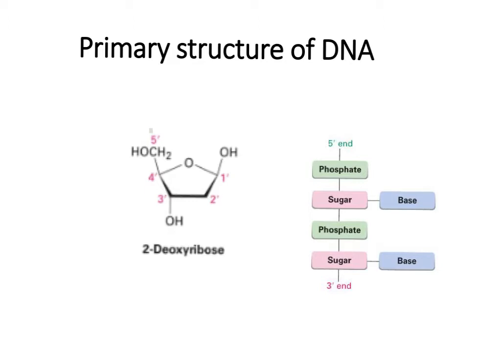Solid phase synthesis has many advantages. Excess of solutions drive reactions faster, impurities and excess of reagents are washed away, and no purification is required. The goal is to create a phosphodiester bond between nucleosides.